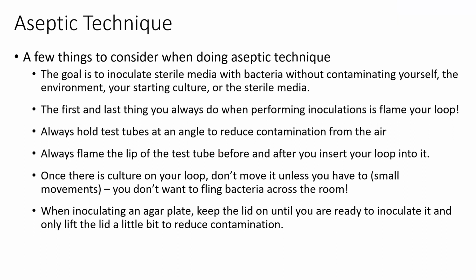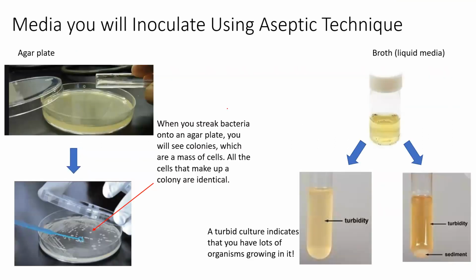All right, so I just walked through these points. The more specific steps in proper order, like I demonstrated for you, is on the aseptic transfer handout. So I just want to remind you of some things that we talked about in the previous video, which is about the types of media. We're mainly going to be using agar plates and broth. So that's what I included on this PowerPoint. But do remember we have slants and deeps, both of which are solid and made into test tubes.